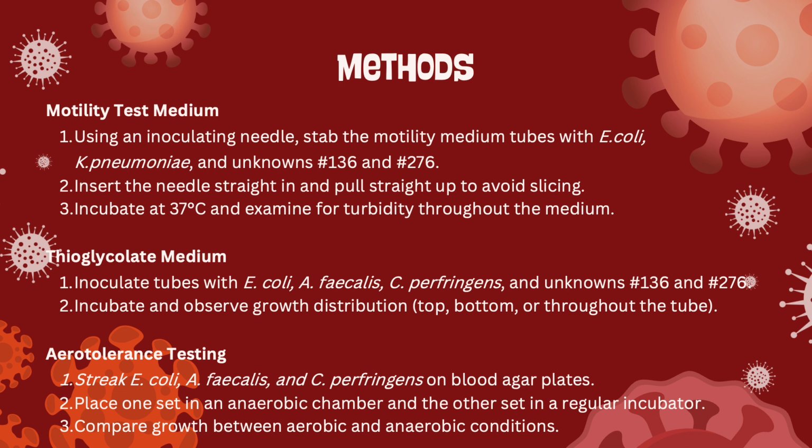For the thioglycolate medium, we inoculated the tubes with E. coli, A. faecalis, C. perfringens, and our unknowns number 136 and number 276. We then incubated and observed growth distribution from the top, bottom, or throughout the tube.